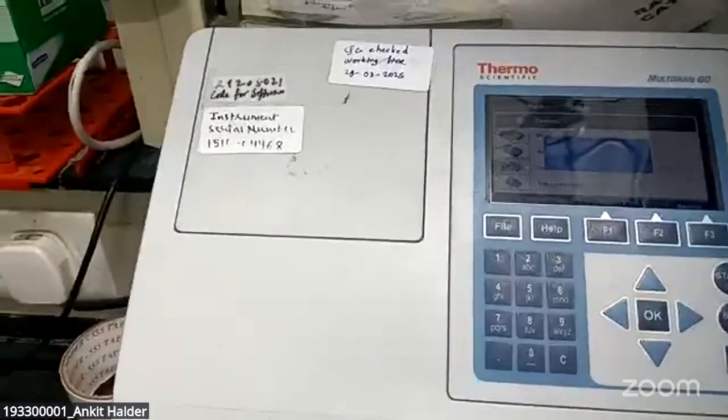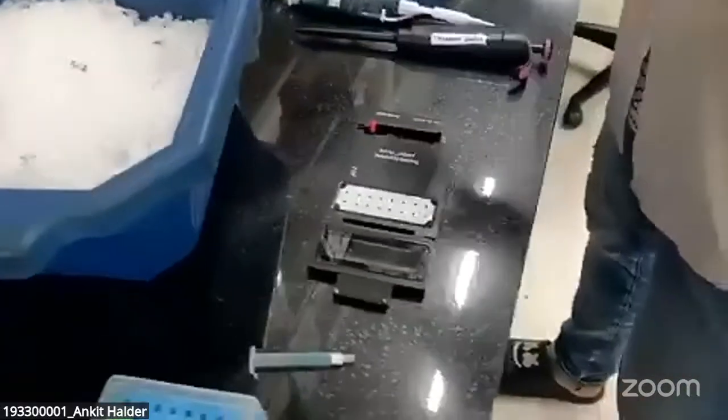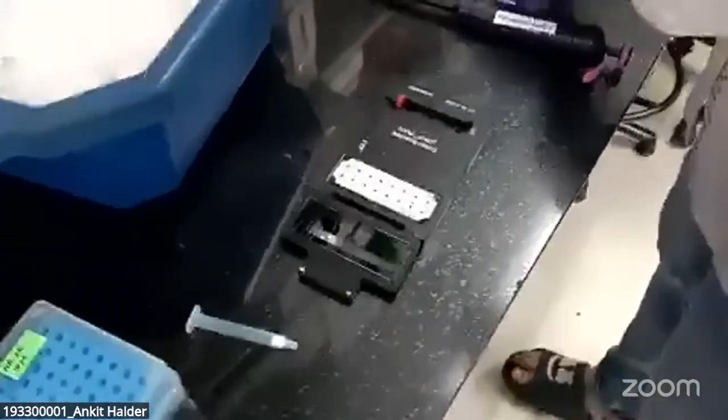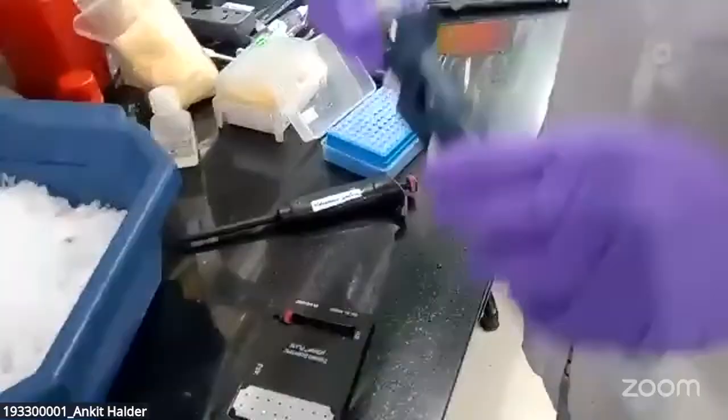Now we are going to put the peptide solution inside the micro droplet. I will be taking 2 microliters of sample.